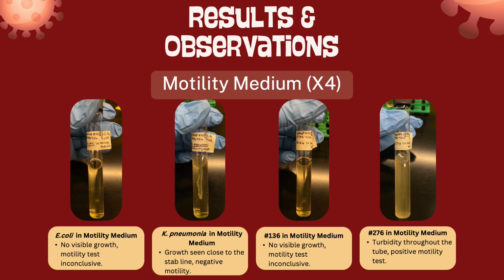The reason for our E. coli and unknown number 136 tests being inconclusive could have been most likely due to the needle being too hot when inoculating, the culture not being fresh or viable, or the medium not being made properly.